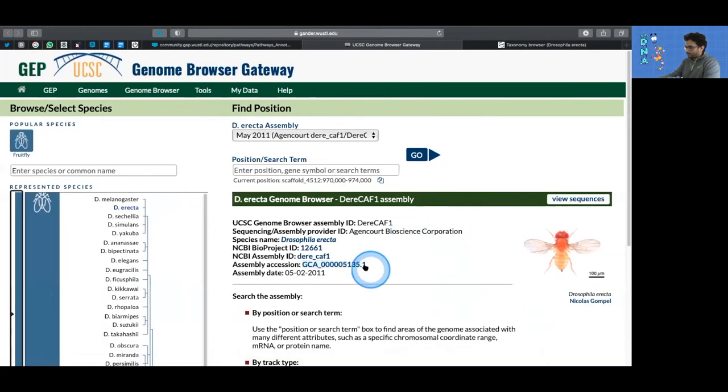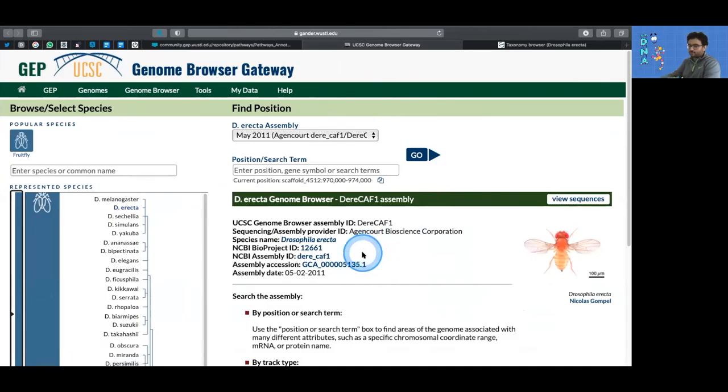If you happen to see this point one or point two, it means it's a version number, and we suggest keeping the version number intact as much as possible.